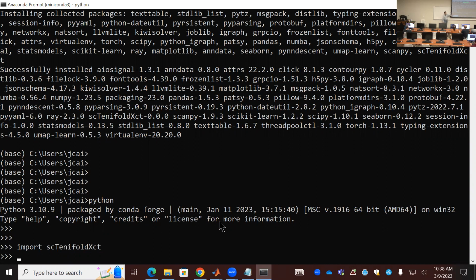We are not going to deal with this because you would have to learn Python to read the matrix in. So we are going to use MATLAB to call this. If you reached this step, that means you have successfully installed the package and we are ready to go.